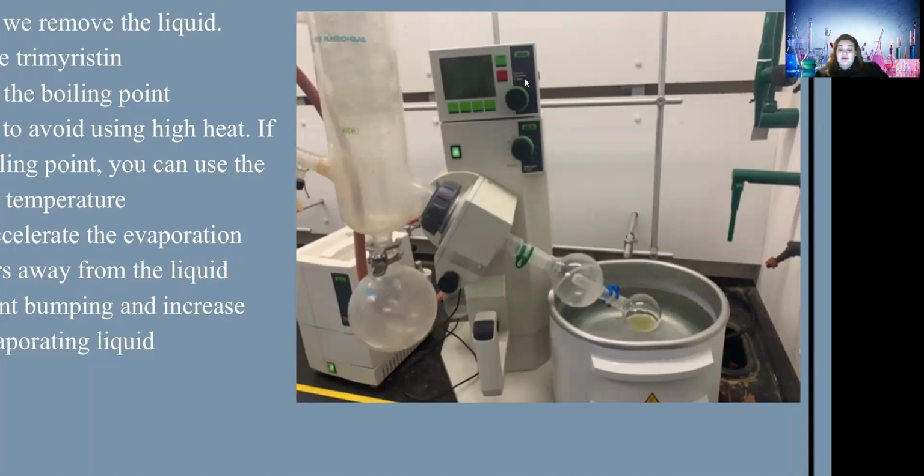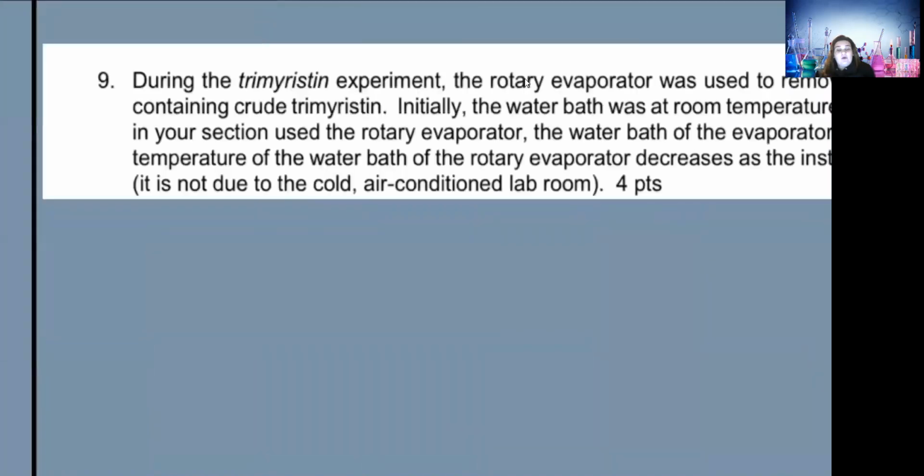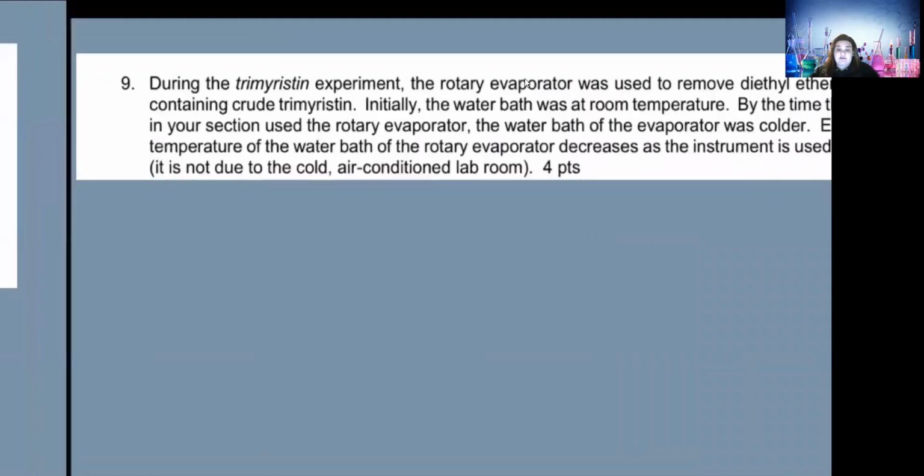And then your round bottom flask actually cools the water bath a little bit, just a little bit, each time a student uses it. So once about 15 students have used the roto evaporator and you get to that last one, this water bath has been cooled enough that it's a bit cooler than when you began. Okay, I hope that makes sense. So let's put this into words.